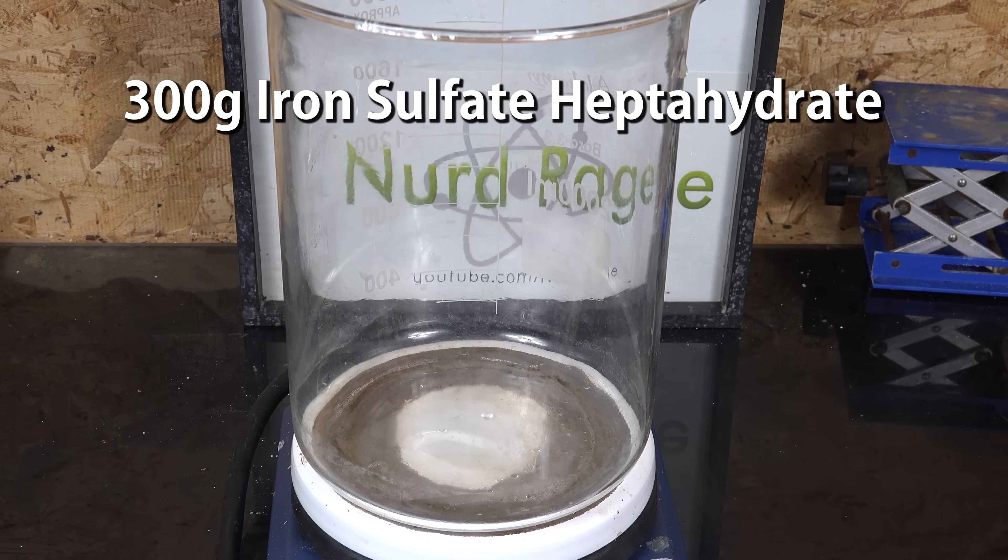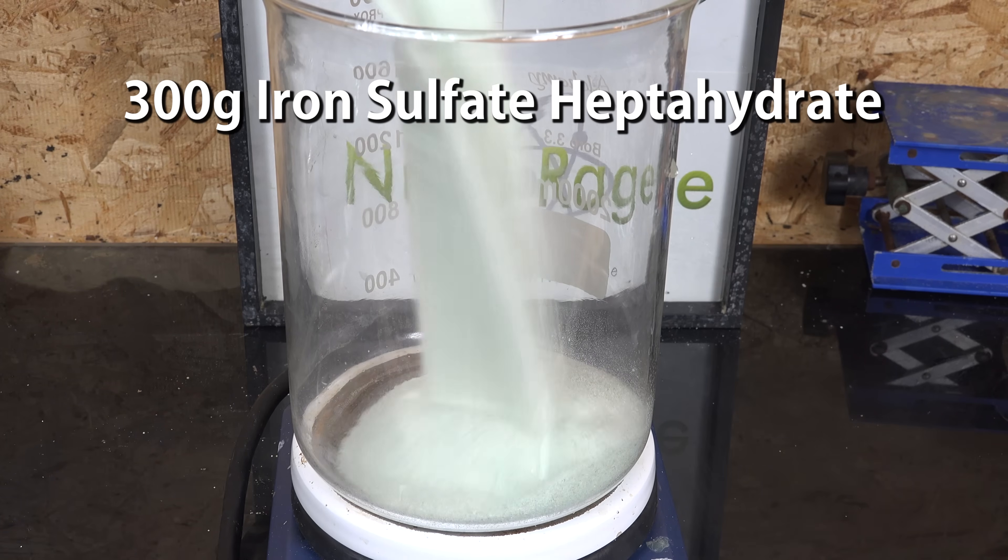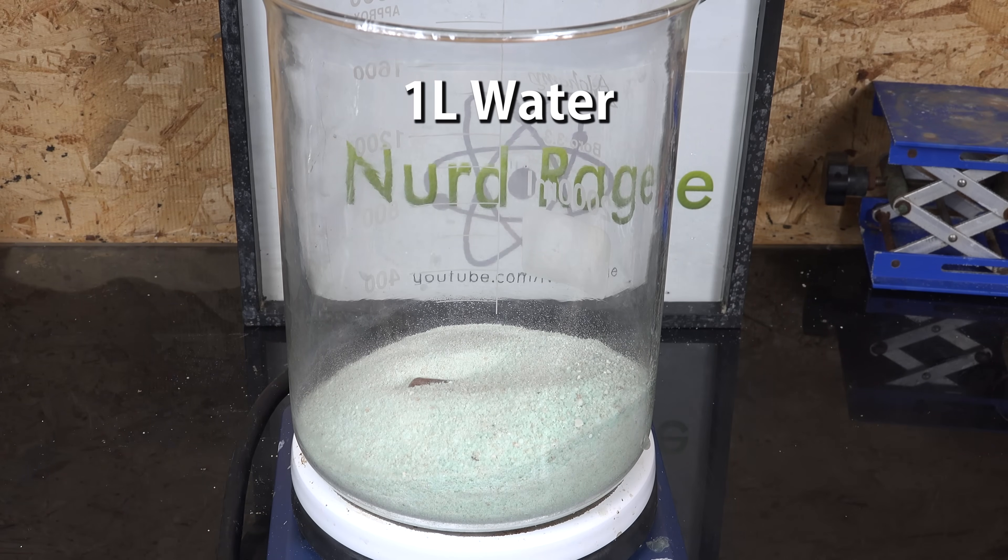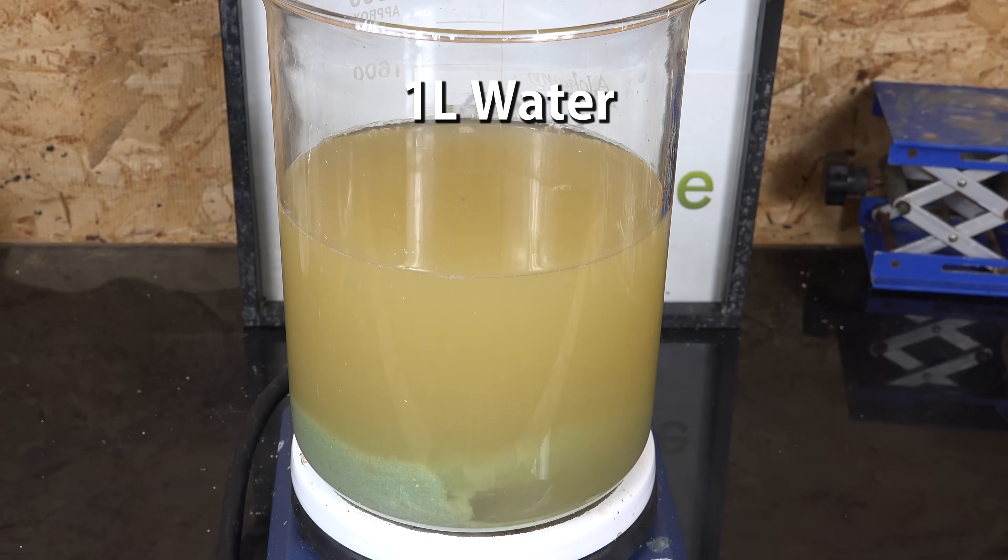First we get 300g of iron(II) sulfate heptahydrate, also called ferrous sulfate heptahydrate. I bought mine as a gardening chemical. Then we dissolve that in 1 liter of water.